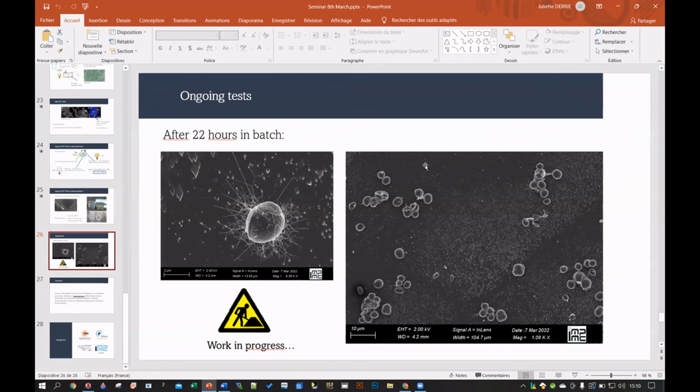We thought about this, but we are sitting on calcite, so we have not tried for too long. And these cells have been through water plus ethanol and critical point drying. So we started very quickly to look for inclusions. But then we thought, okay, we should have collected some suspension, put it on a filter, and checked whether they had inclusions, more or less, and so on.